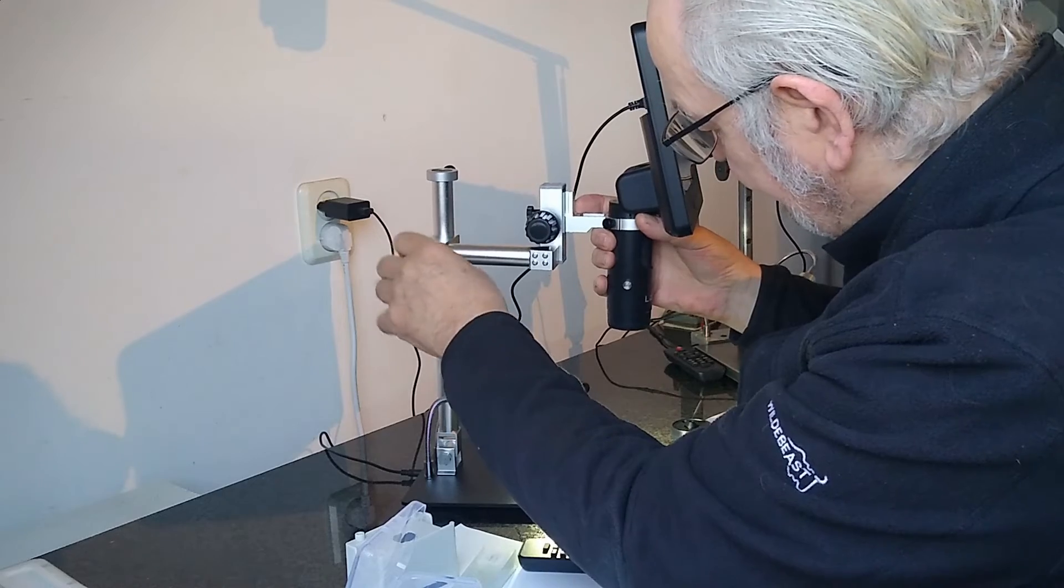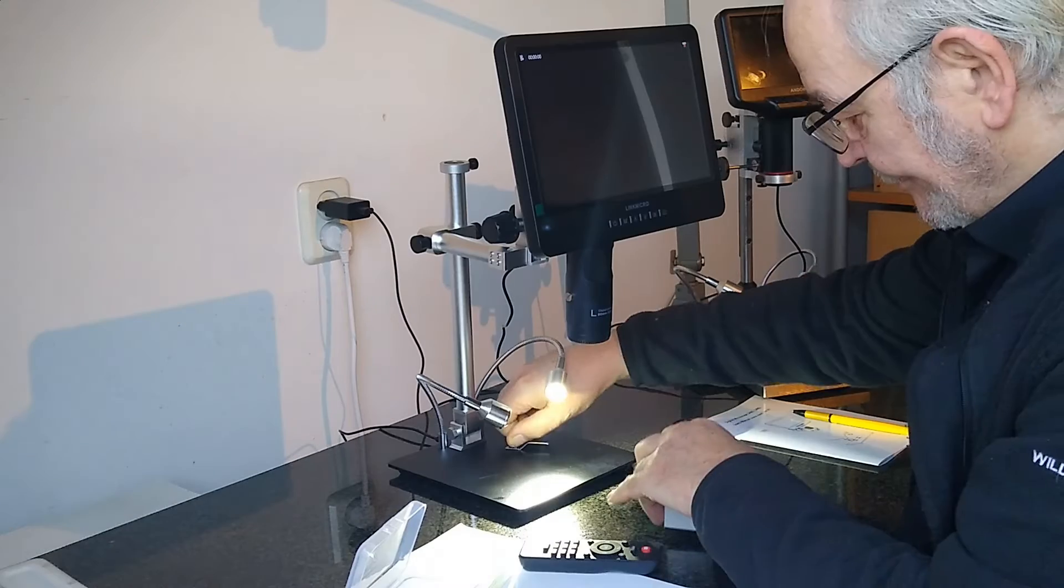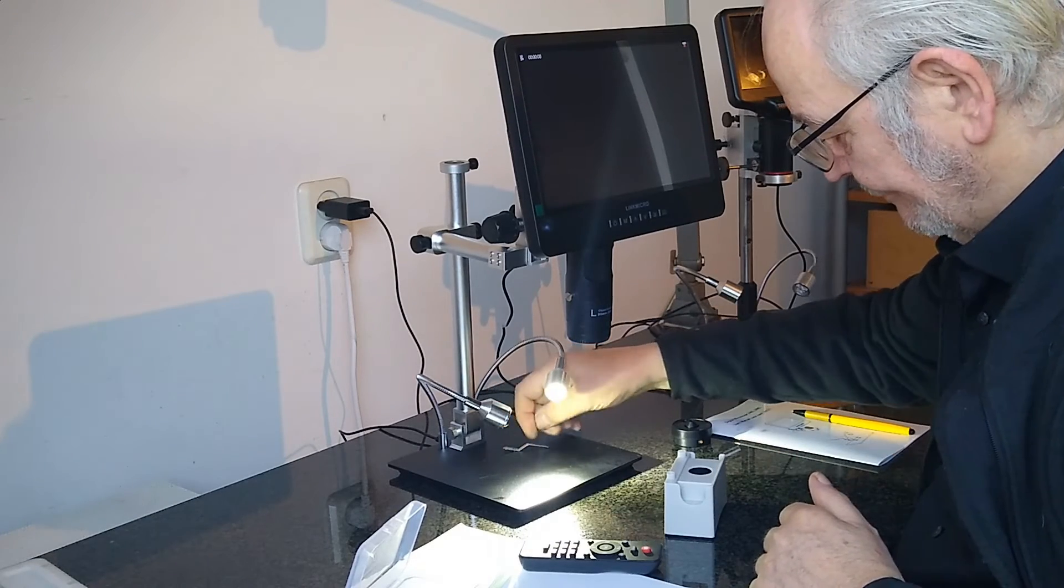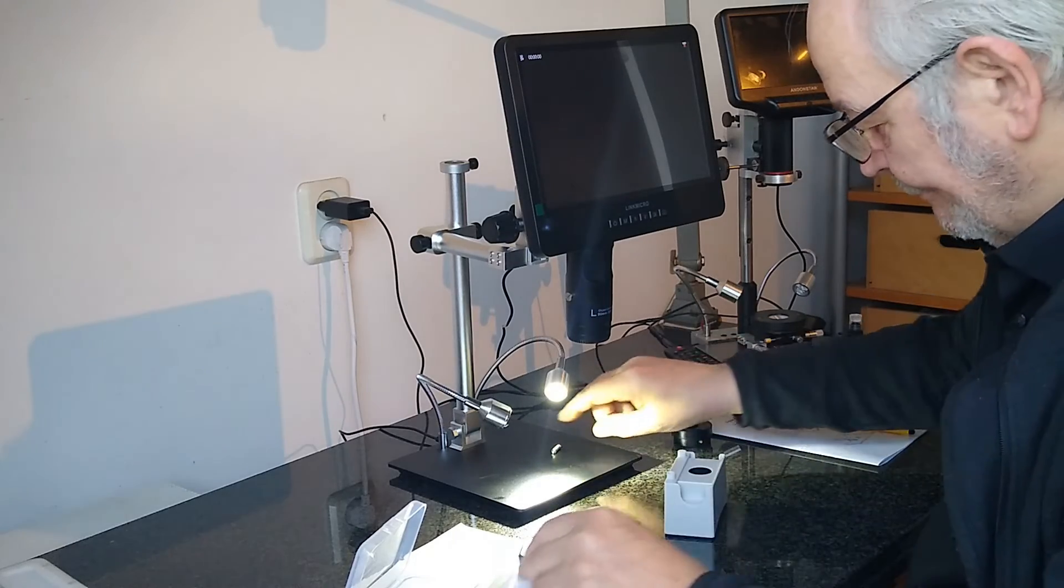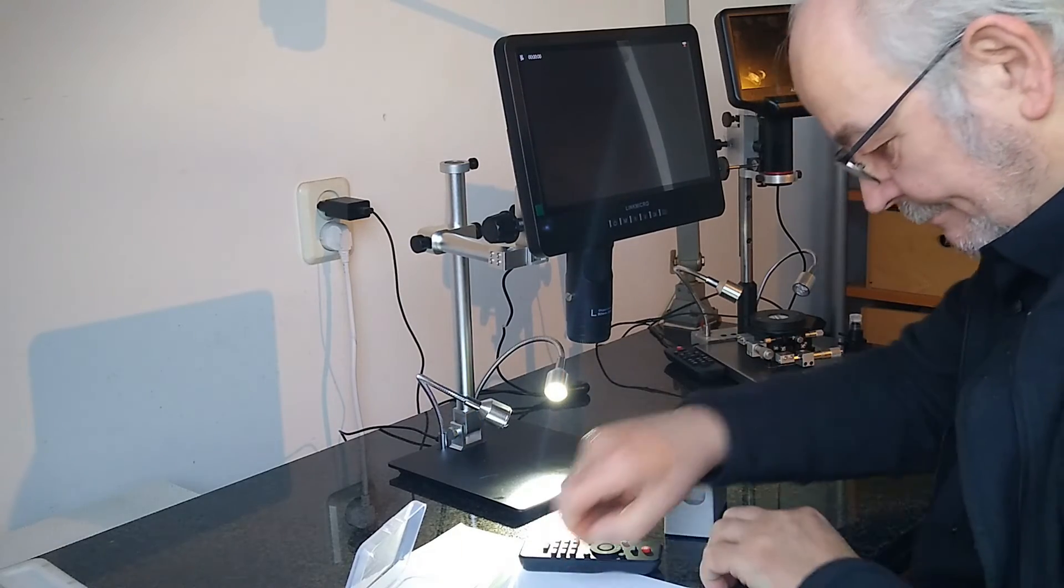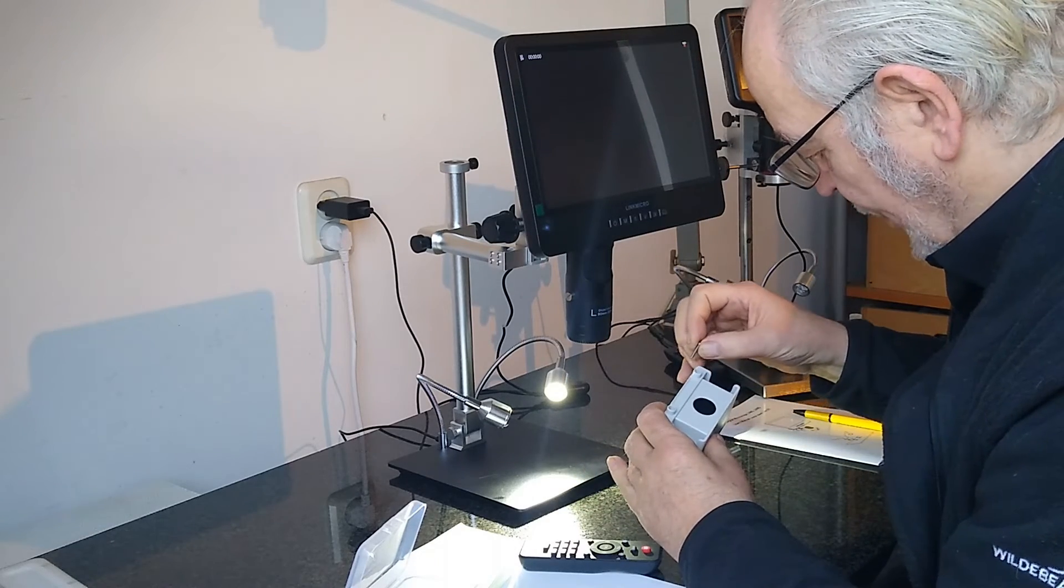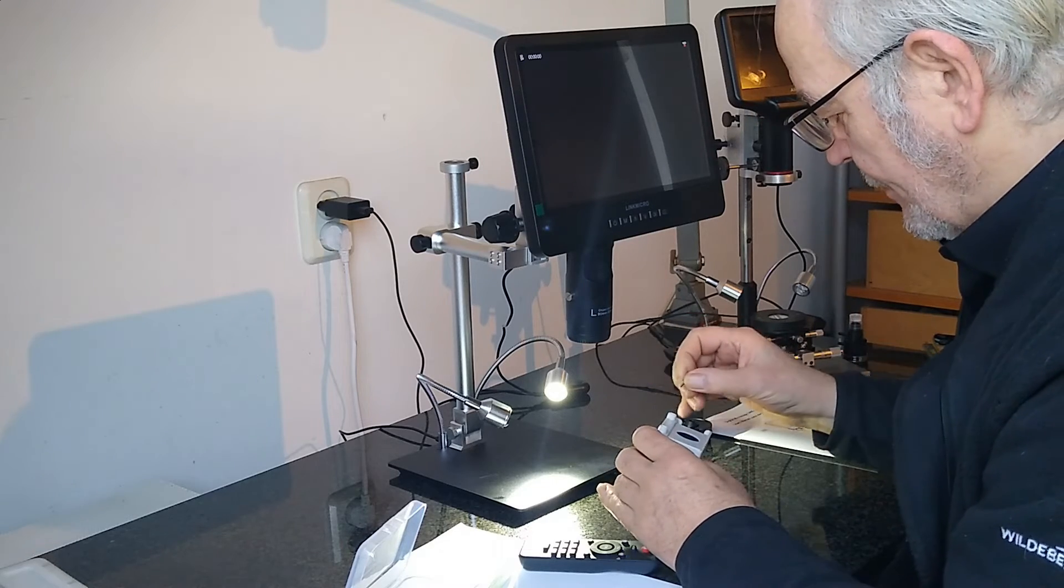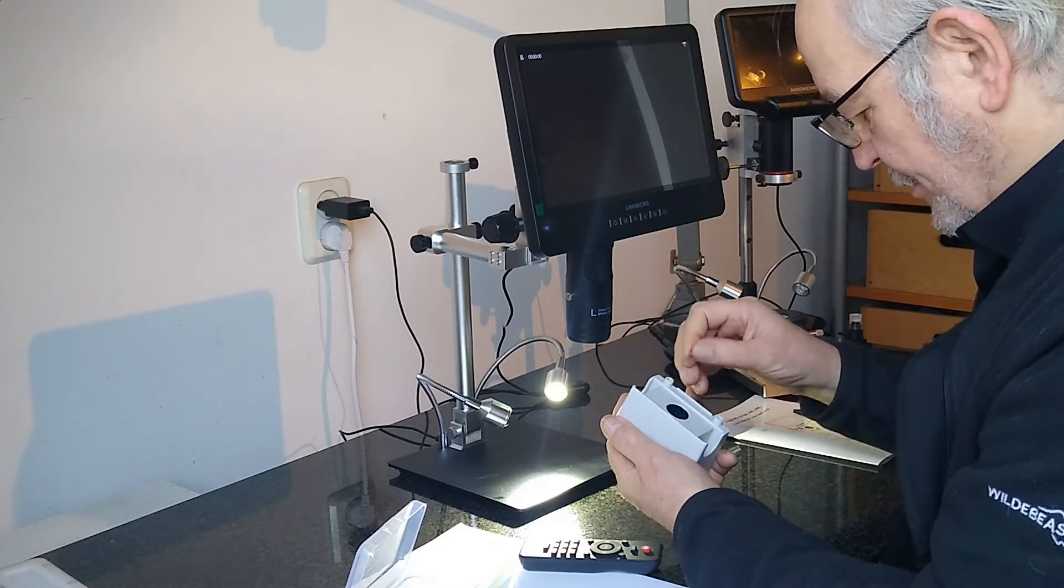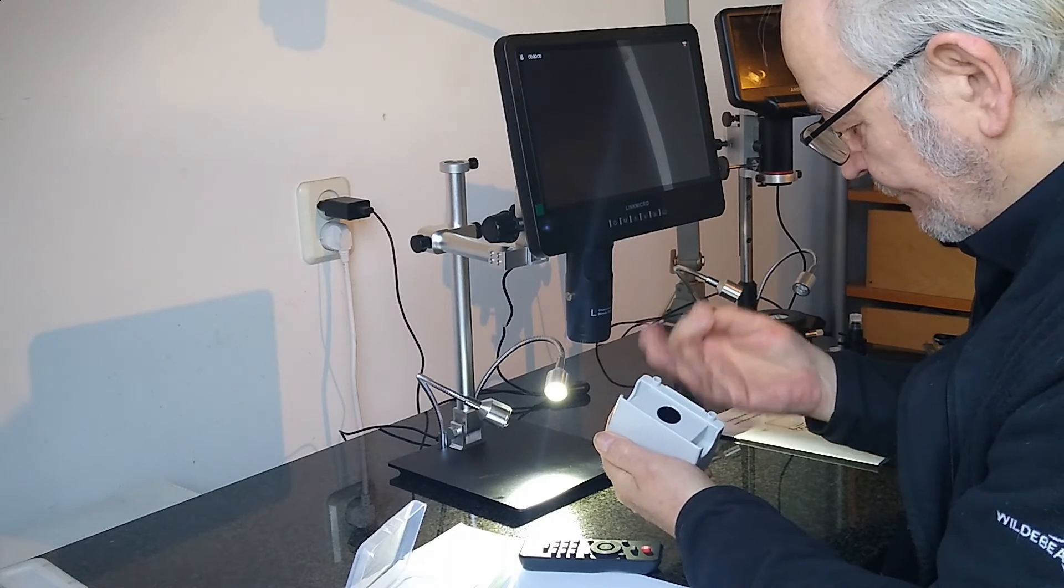The fact that the base plate is now really too small is noticeable when you pull out the boom. The center of the image now lies over the front edge of the base plate. And in the only place where the spring clips could be useful, on the simple lightbox, the supplied screws do not fit.